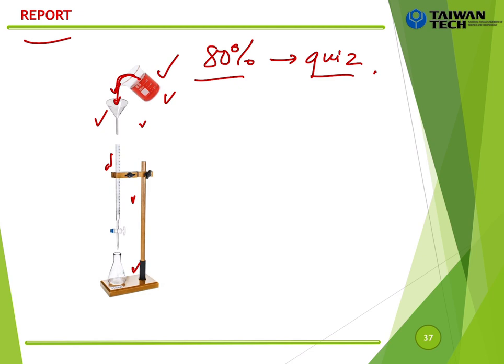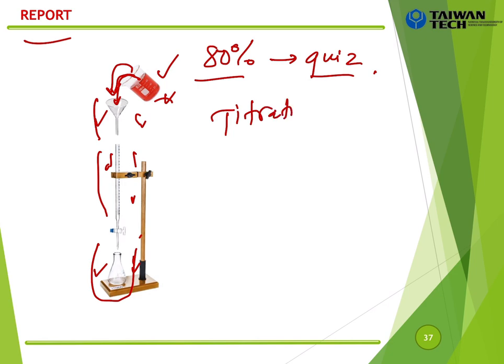And after it comes to the burette, you take the titration, so you put another flask here, and then you can make some titration. It means that we combine together in one process. So first I add the chemical into here, I need this one, and I can get the chemical into this burette, and after that I can use this one for titration. So it means that this is the process for my titration. Okay, so for titration I use 1, 2, 3, and 4 pieces of equipment.